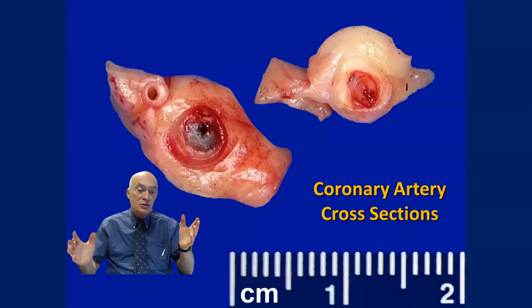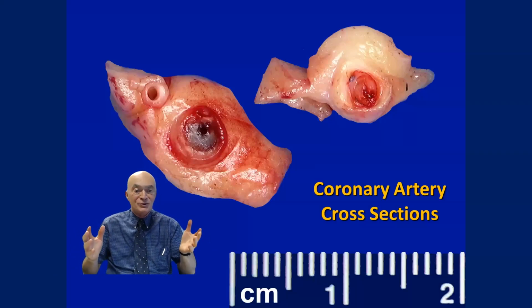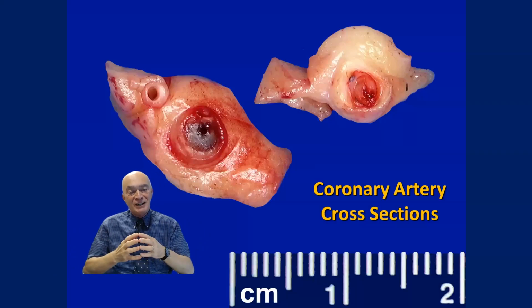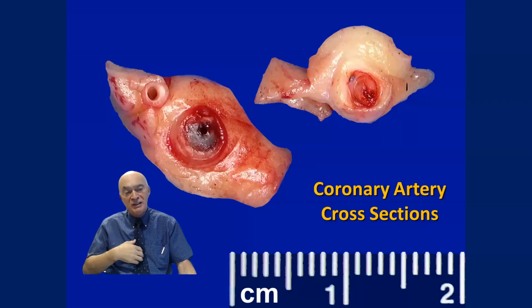And in some cases, you can do even a dissection of the coronary arteries without fixation. And this is a case of an autopsy case when I was doing some coroner office work many 25 years ago. And this patient was about 55 years old, and was complaining of indigestion. So his symptoms were related to the GI tract, and he was feeling this pressure. He was taking antacids and things like that.